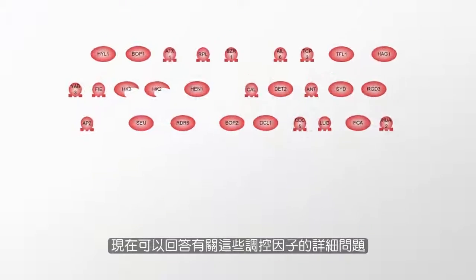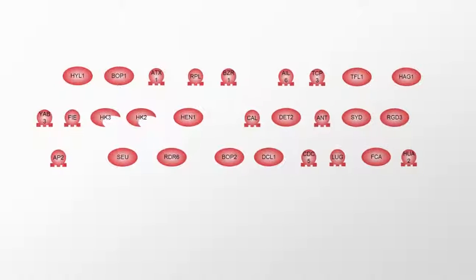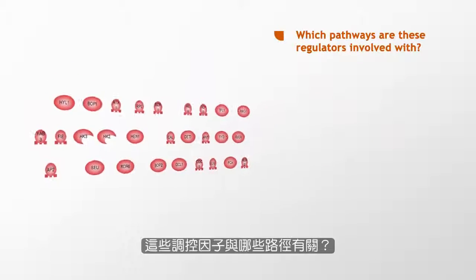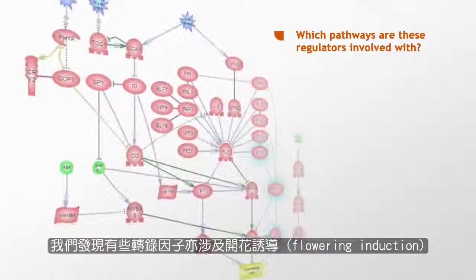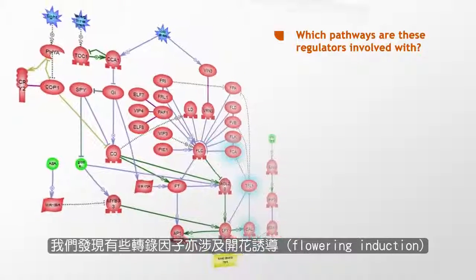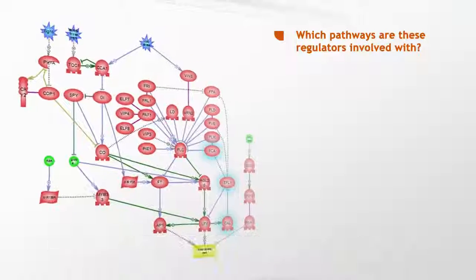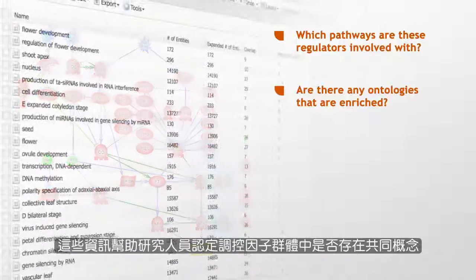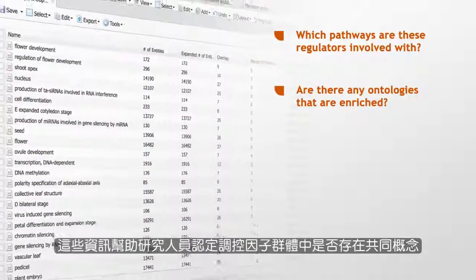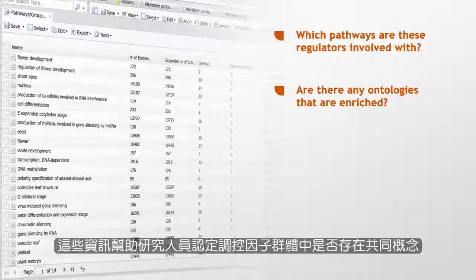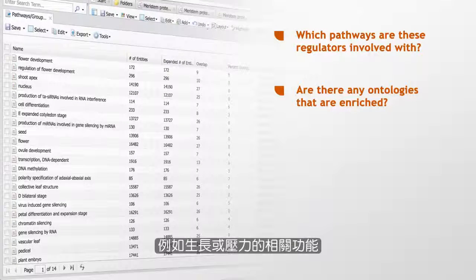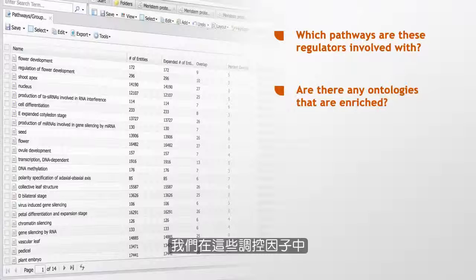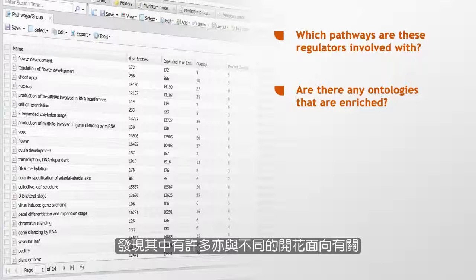Which pathways are these regulators involved with? We found that some transcription factors are also involved with flowering induction. Are there any ontologies that are enriched? This information helps researchers determine if common themes exist in the group of regulators, such as growth or stress-related functions. We see that many of these regulators are also involved with different aspects of flowering.